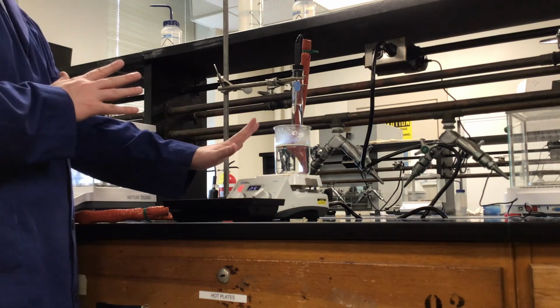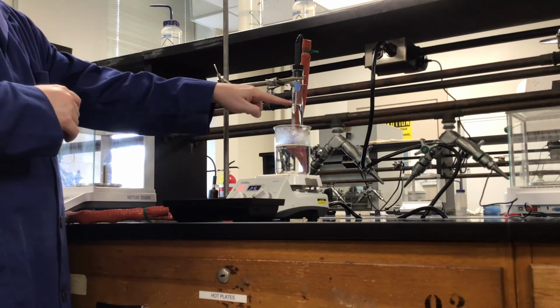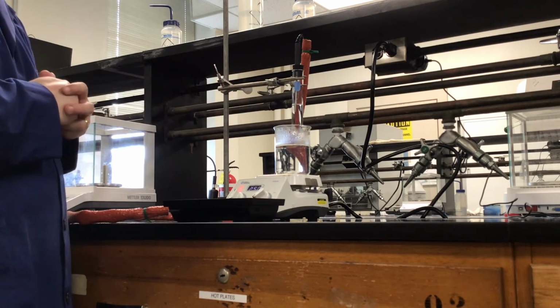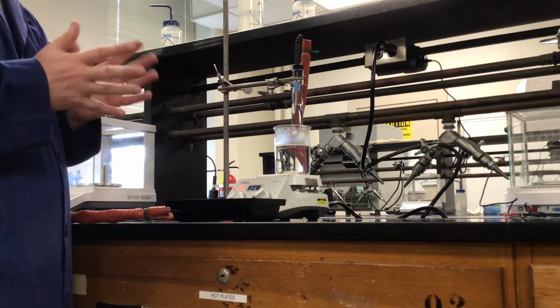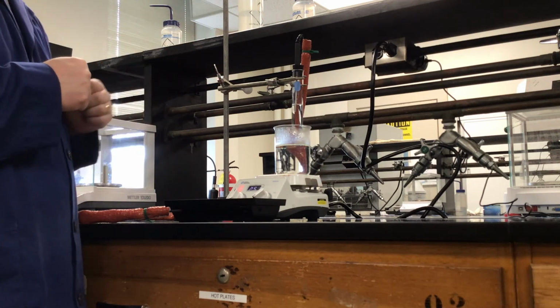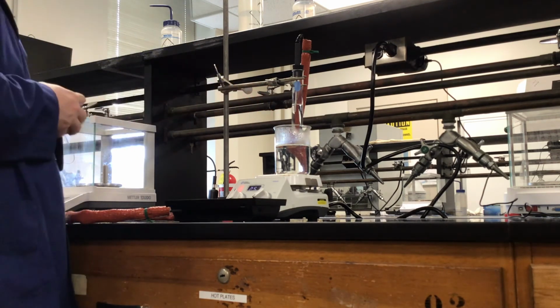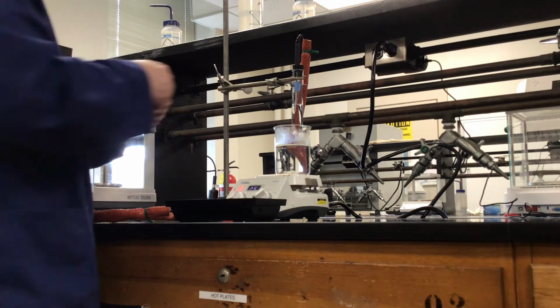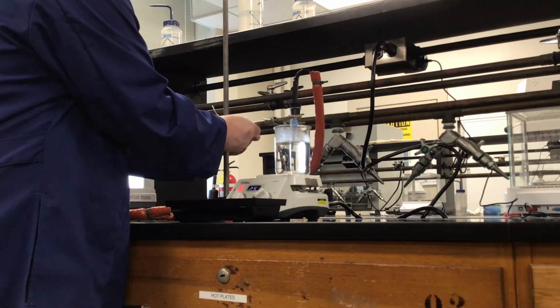We do have a hot plate, and basically we just made a hot water bath here. We got the water hot so that we can take our ethanol solution, put it down in that bath, and actually warm it up. Then we just have a LabQuest with a thermocouple so we can measure the temperature of our solution as we go. And what we're going to be looking for is 2 things. We're going to be looking visually for when the solution inside the test tube starts to boil. And I'll go ahead and lower this now so you can start to see the temperature rise.